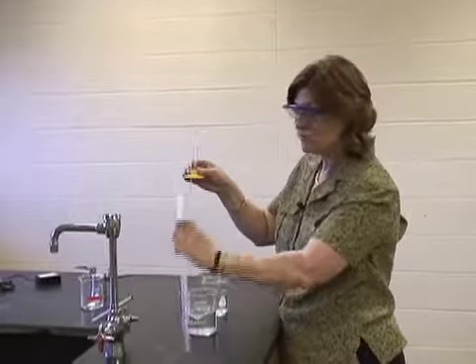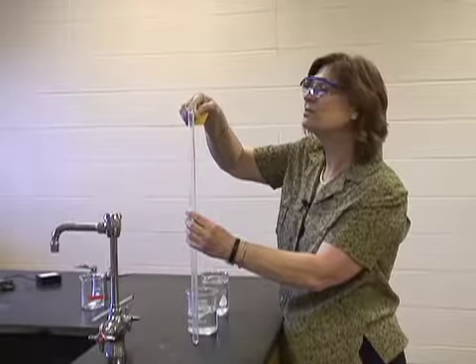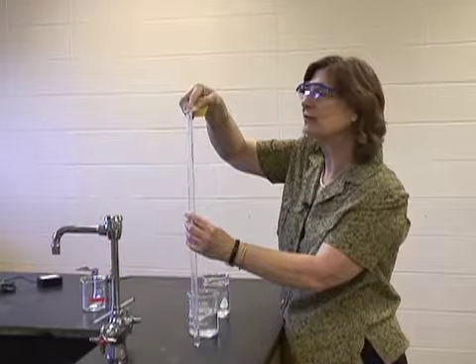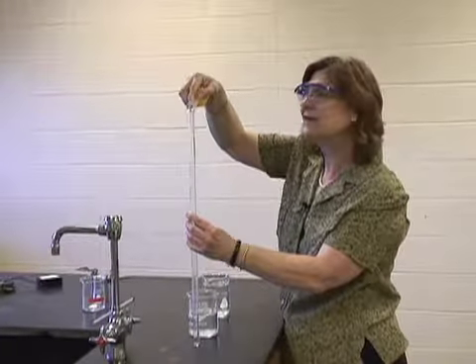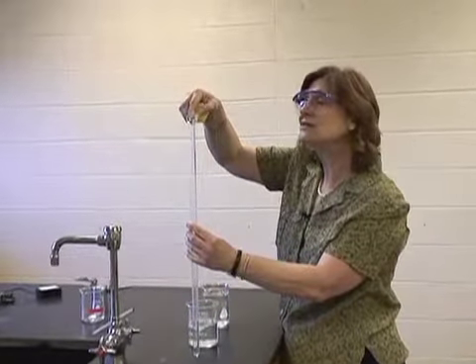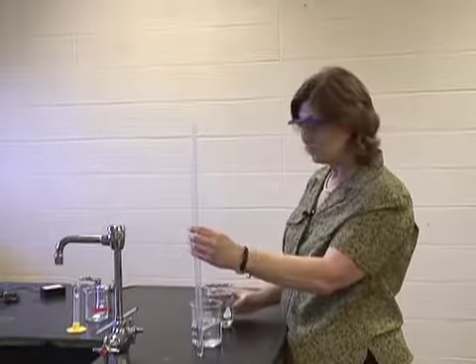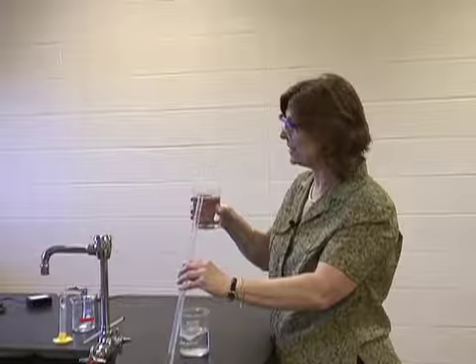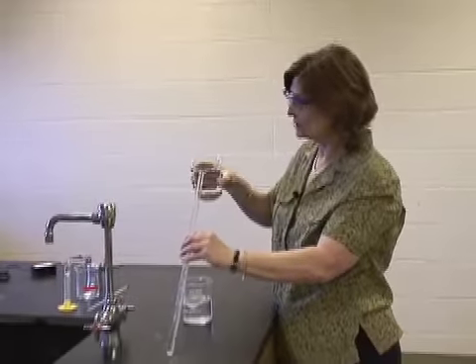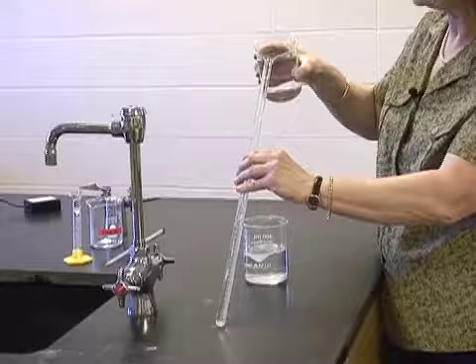So I will take my eudiometer and I will pour my 10 milliliters of my 3.0 molar concentration of hydrochloric acid. And we're going to learn what molarity means, but for now, it just tells us the concentration, and that's all we need to know. Then I will pour the remainder in for water. Slowly, so I don't mix that hydrochloric acid there in the bottom. I want it to stay on the bottom.